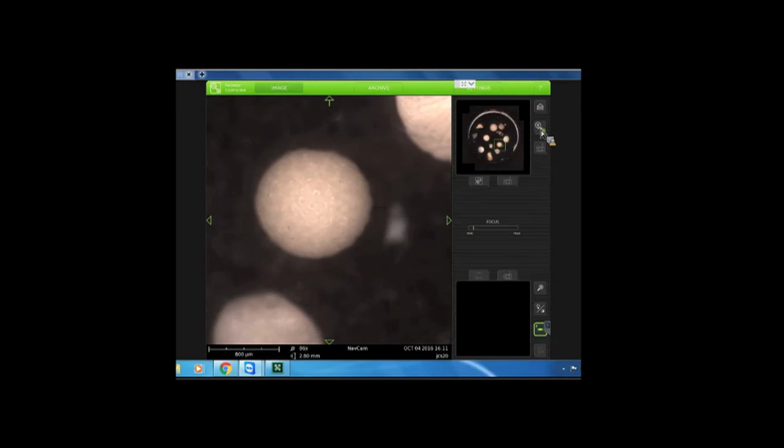But if you want, right now we're looking at an optical image of the marine fossil, and if you could hit the button on the right where you see the little cross. Oh, I see it there. Yeah, I see it. Okay, I'll hit it. To the scanning electron microscope. All right, good job. Okay, here we go. It does take a little bit of time to load the scanning electron microscope. So. Oh, I see the progress bar there. Yeah. Progress. I bet you have a great joke.